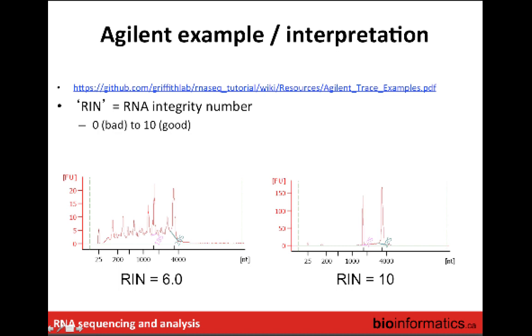As RNA gets degraded, the large ribosomal RNAs start to break down into smaller pieces, producing additional spiky peaks to the left of your two expected peaks on the electropherogram. The more degraded the sample, the harder it becomes to see the 18S and 28S peaks. Based on this pattern you can estimate an RNA quality score.